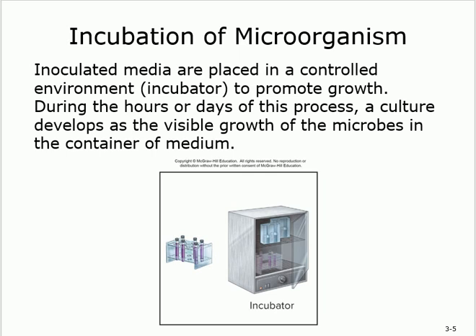So you put it in, say it's clear purple, and you leave it there for whatever time; they know the exact time that's needed, approximately. So we're going to study it after a couple of hours, after a couple of days, depending on the species. And then we look at the changes. It was clear purple, for example. Now it's getting a little bit cloudy and a little bit solid, and you see patches or something. So these are visible growth changes. You can see them and you say, okay, I'm done now.